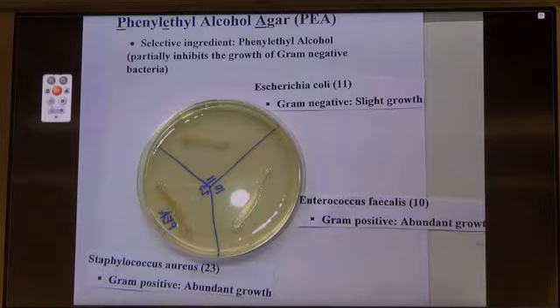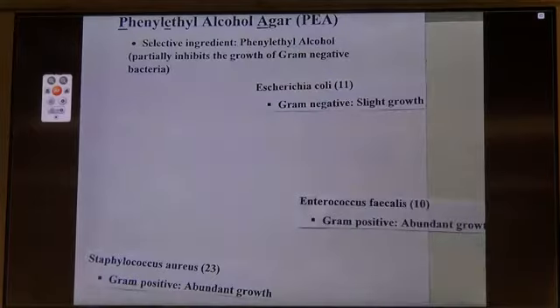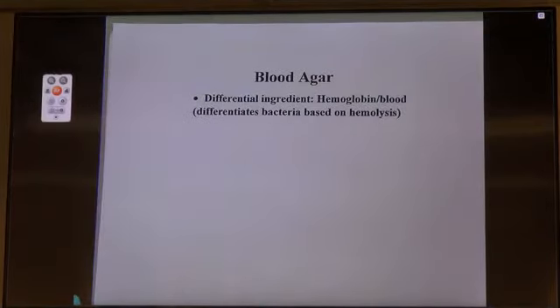Okay. Last medium, please do not open it. All right. Blood agar. Blood agar is differential only, and the differential ingredient in blood is hemoglobin or blood itself.